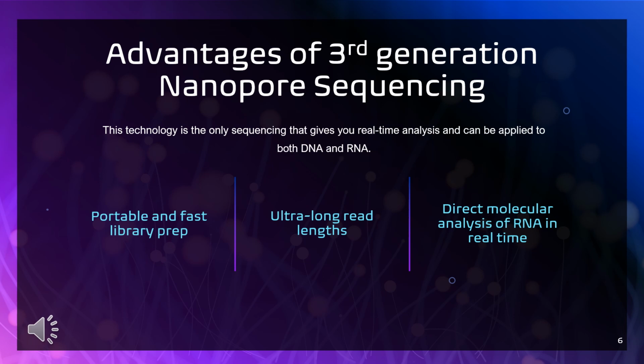Finally, nanopores allow for direct electronic analysis of your DNA or RNA and avoid bias when dealing with the traditional amplification of nucleic acids in regular sequencing methods. This also opens up opportunities for epigenetic analysis, which I will talk about in another slide.